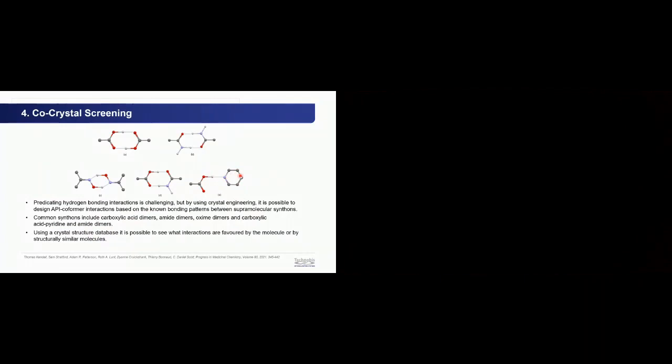And again, this isn't a hard and fast rule. It's not going to give you exact knowledge of where the bonding is going to occur. There have been several cases where I've designed a co-crystal screen, thought that's where the bonding site is, only for the single crystal to come back and be completely not what I expected. It's not even involved in the bonding structure at all.